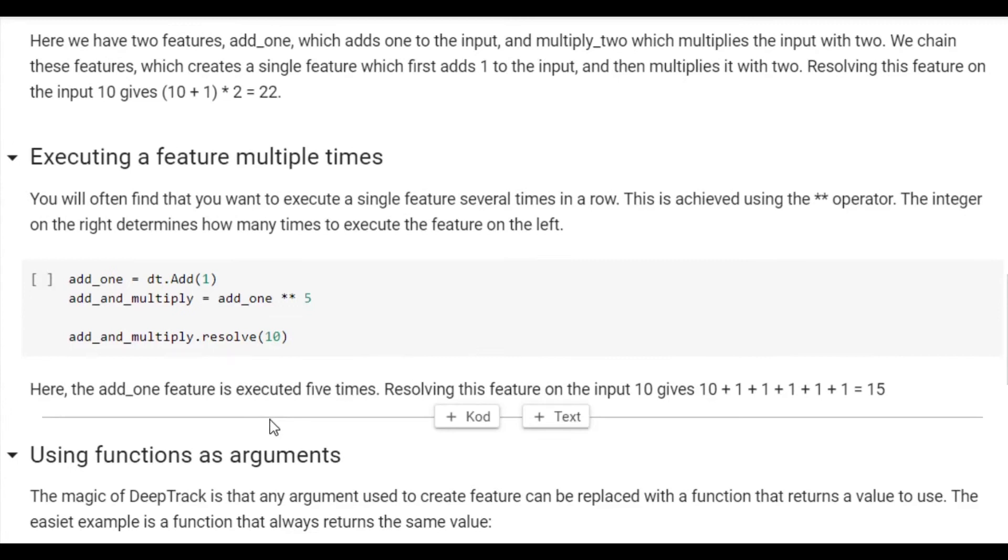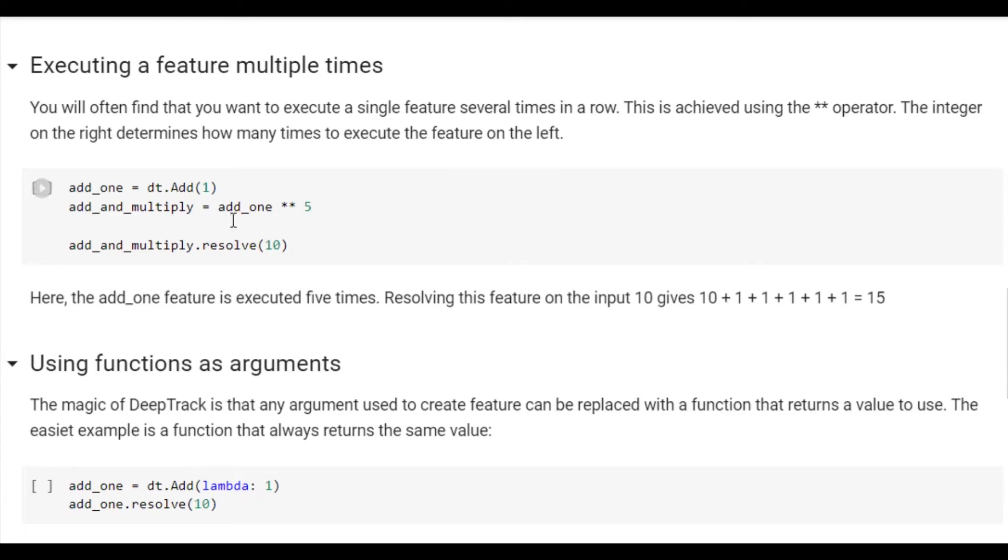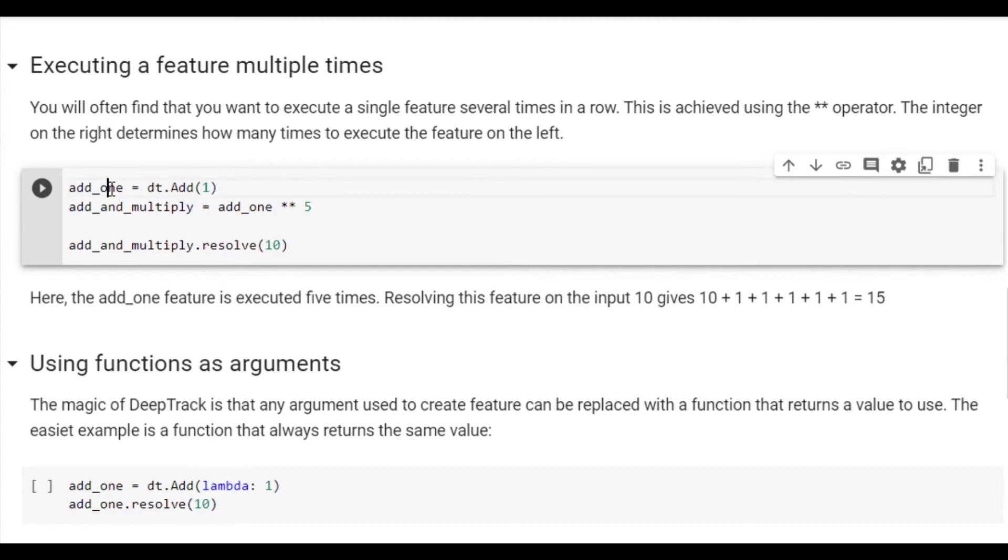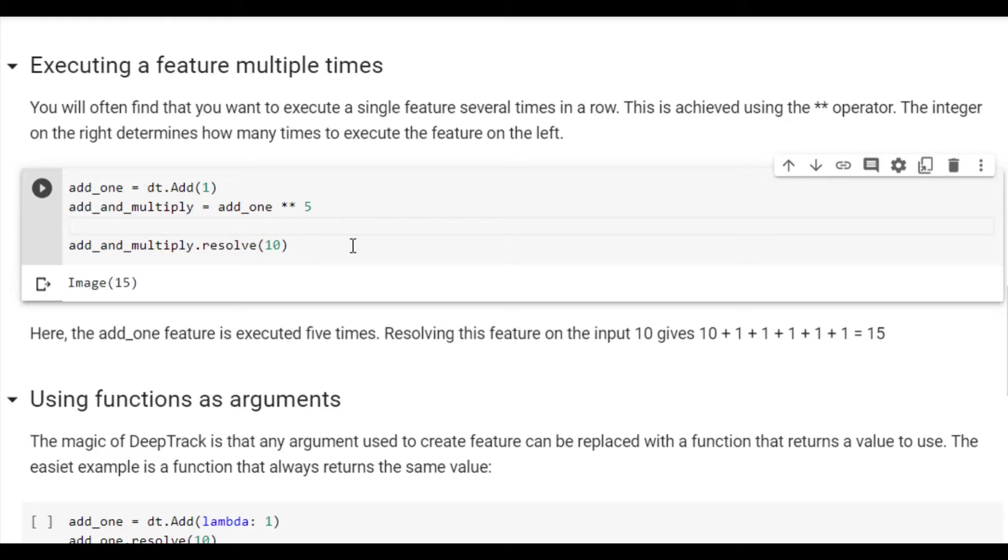We can also execute a single feature multiple times using the power operator, or star star. Here, we create the add1 feature and we tell it to be executed 5 times. This gives 15, because 10 plus 1, 5 times, is 15.